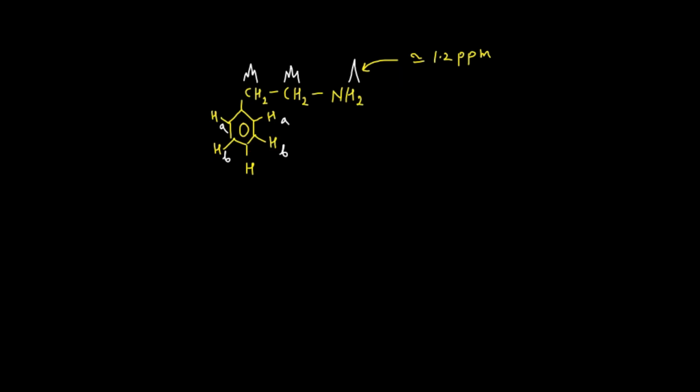So these are different hydrogens, and this is your third set of hydrogens. The environment of this hydrogen is only two. So these three groups are forming on the benzene ring, and this is the very common pattern of a mono-substituted benzene. So the signal which you are getting at 7.1 ppm is due to these hydrogens.